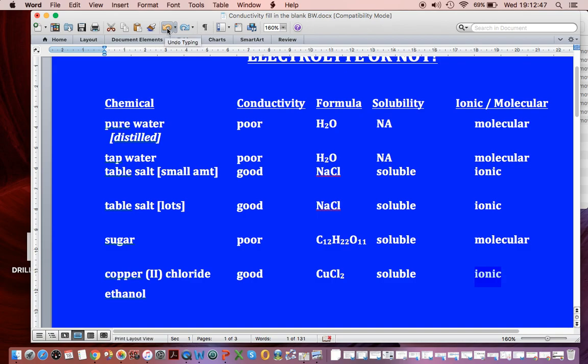Then we hit ethanol. And that is a form of alcohol. And it was poor. There's its formula, CH3CH2OH. It is soluble. But it is molecular.